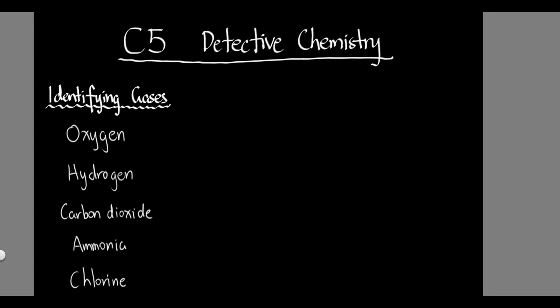of what's gonna happen. As far as I can help, I can list all the notes and stuff like that, but I would still suggest you watch a real life practical experiment for these points, to make sure that you have a full comprehension of the knowledge. But anyway, as I've said, this unit consists of many small practicals. So we're just gonna focus on them one by one, and today our topic is going to be identifying gases.